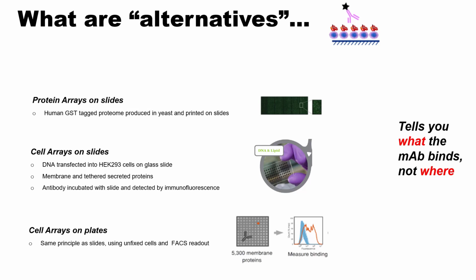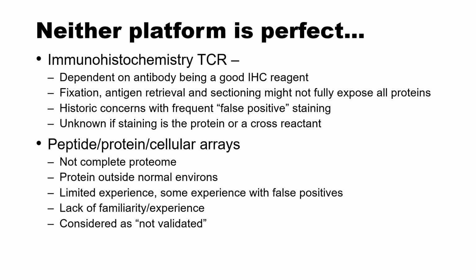Now, it will not tell you in what tissue and cellular context it would bind to. So there certainly are some positives and negatives to either approach. The tissue cross-reactivity approach utilizes immunohistochemistry, so it's dependent on the antibody being a good IHC reagent, which is actually quite rare for therapeutic antibodies.